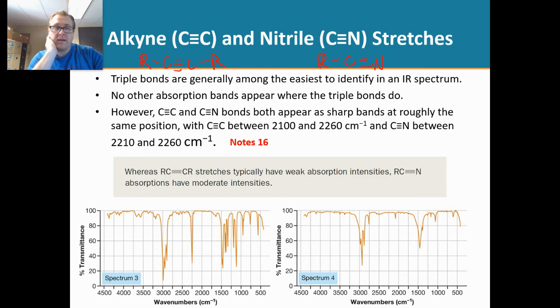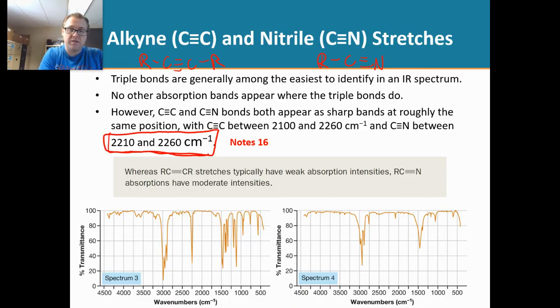Now, these stretches are so easy to identify on an IR spectrum. And the reason why they're so easy to identify is because no other stretches appear in this range. So if you see signal in that range, that's a very sharp peak, then you know with high confidence that you have an alkyne or a nitrile.